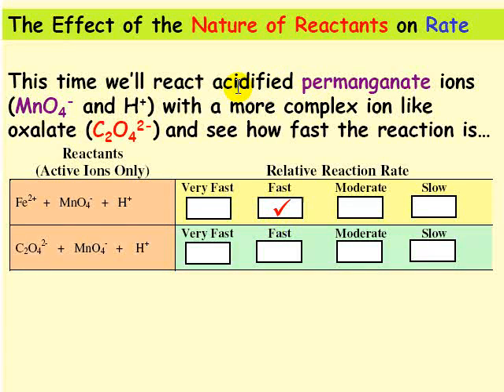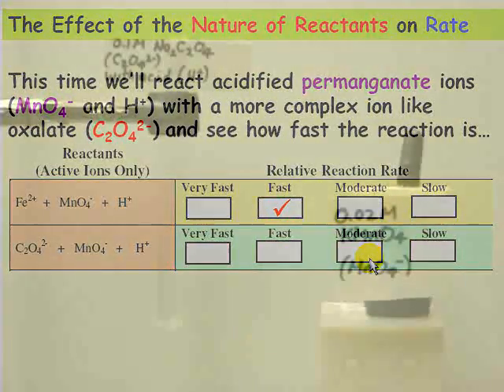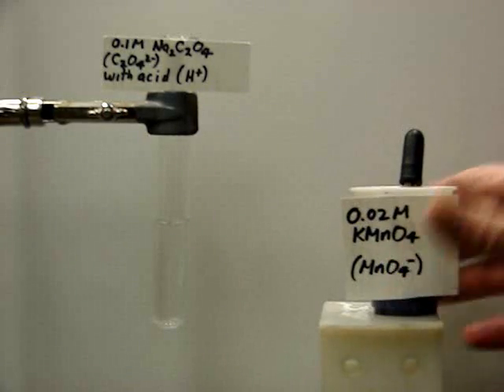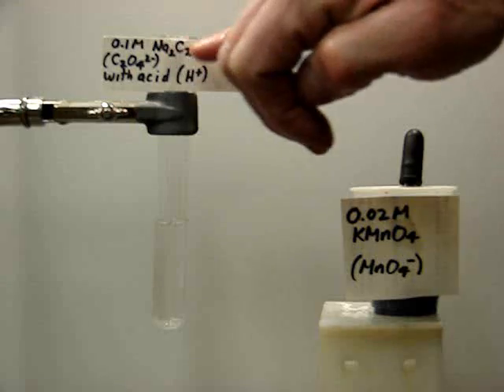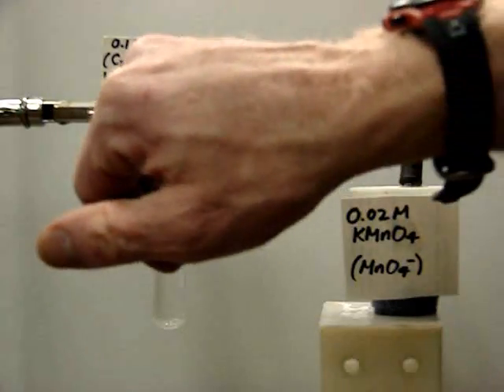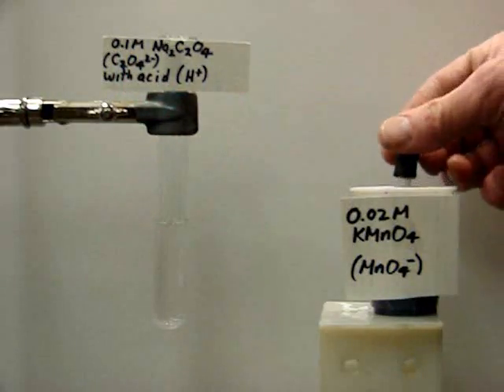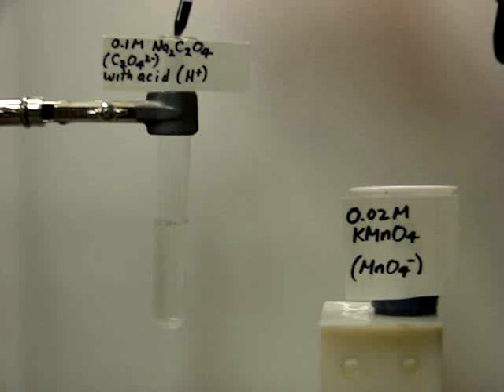Now we're going to add the acidified permanganate, the MnO4- and H+, to a more complex ion. This ion is the oxalate ion, C2O4^2-. And we'll see how fast that reaction is. Now we're going to add some of the purple KMnO4 to a solution of sodium oxalate, Na2C2O4. This is the source of the oxalate ion, C2O4^2-. This has also been acidified. Let's put in five drops of the KMnO4.